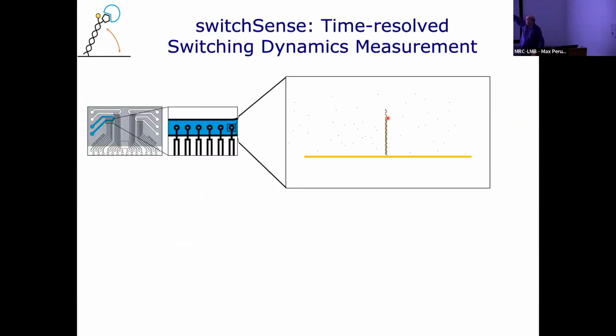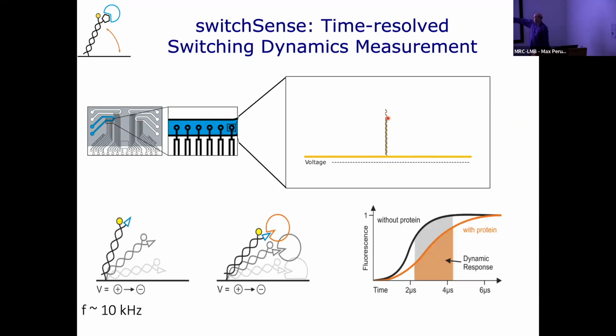So you can imagine here's the nanolevers flowing in buffer, and okay, so the fixed nanolever is attached to the 5' end. There's a 3' fluorophore, and then the complementary strand has a 5' free. So if anything binds, that's going to slow that motion down again. And then hopefully at some point, your protein of interest is just going to fly off, and then the motion is going to come back to the same speed. So what we're essentially looking at in the bottom here is the dynamics of this response in this microsecond time frame, of how this nanolever changes in this alternating field.